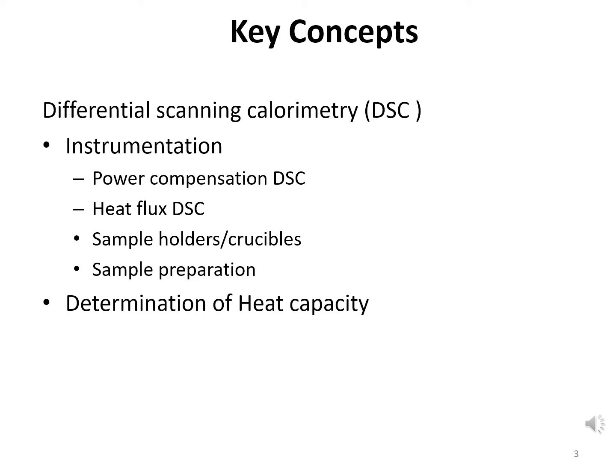We will discuss the main difference between the two types, and then we will discuss some sample pans and the sample preparation that is needed for analysis. After that, we will discuss what heat capacity is, and how we can determine it by DSC.